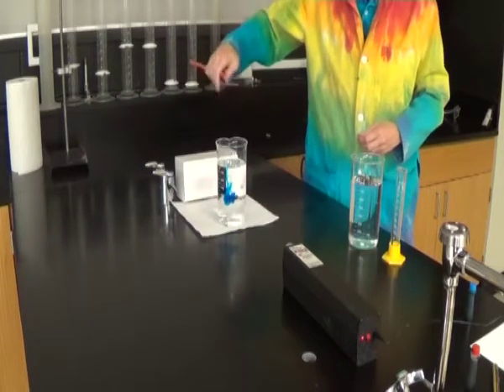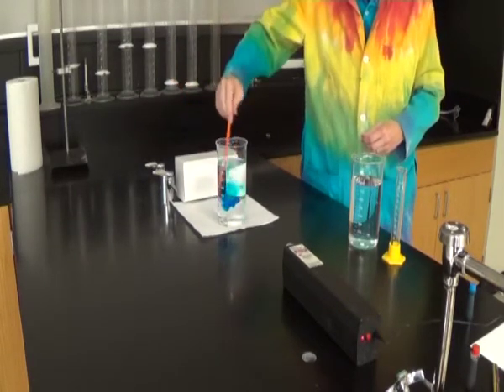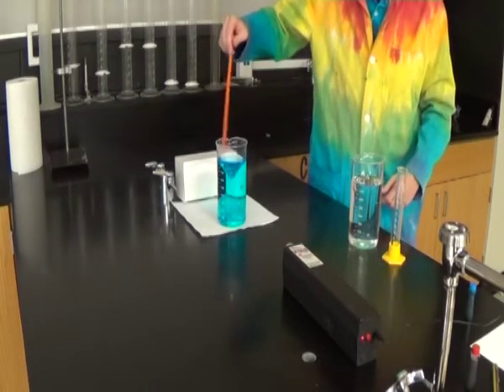The color or wavelength of the filter chosen for the colorimeter is extremely important, as the wavelength of light that is transmitted by the colorimeter has to be the same as that absorbed by the substance being measured.